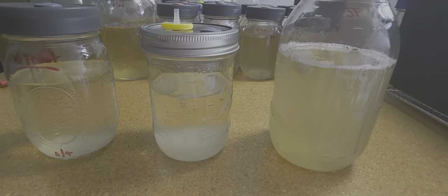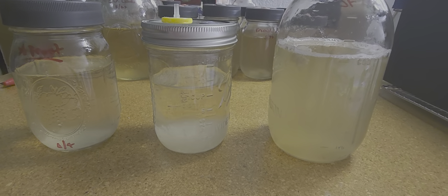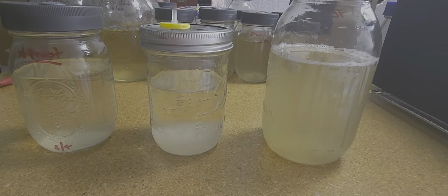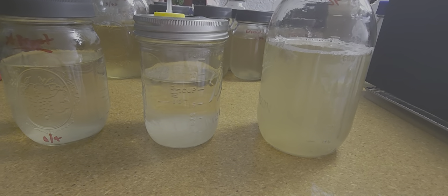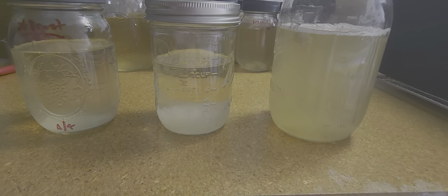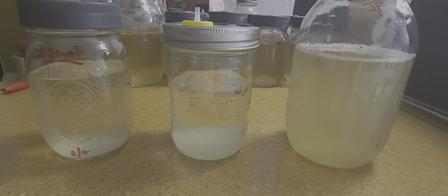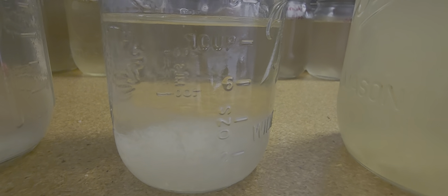Just because your culture is maturing and producing more, that doesn't necessarily mean that the broth it's in is not contaminated. The mycelium will still try and grow in there even if it is contaminated, and it's just really hard to tell sometimes if your liquid culture is contaminated.